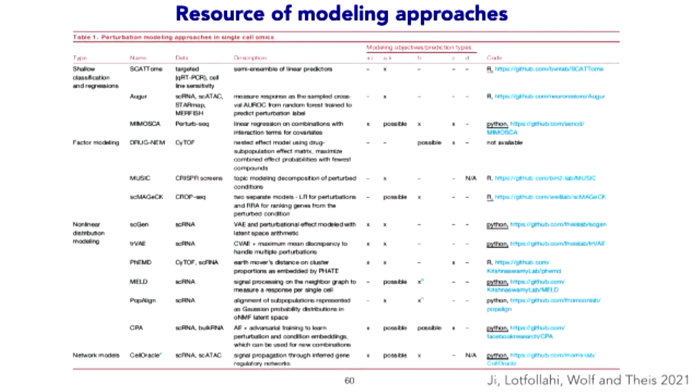Where would you go next if you wanted to delve deeper into Perturb-seq and play with some data sets, come up with new computational methods? A wonderful review was published just this week, and I'm just showing a table from it where they have summarized all the different perturbation modeling approaches in single-cell screens that have been published to date.